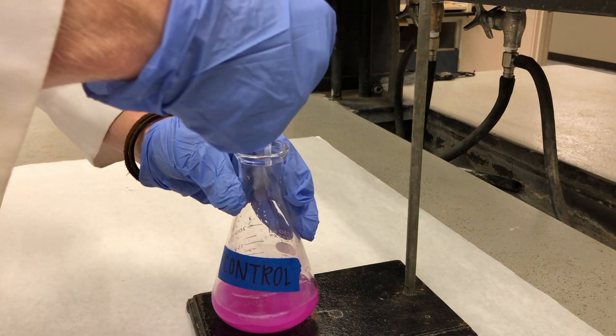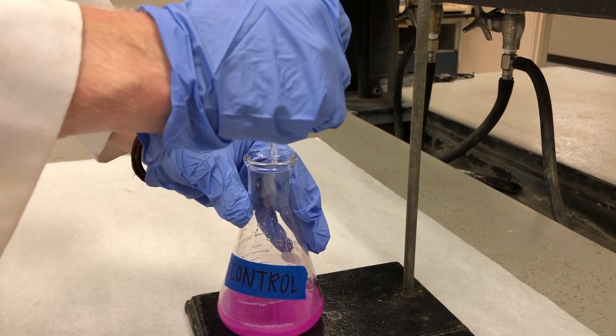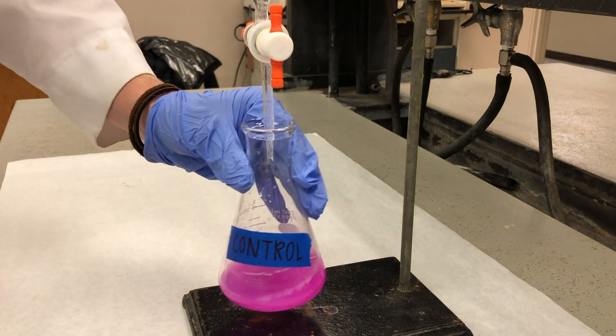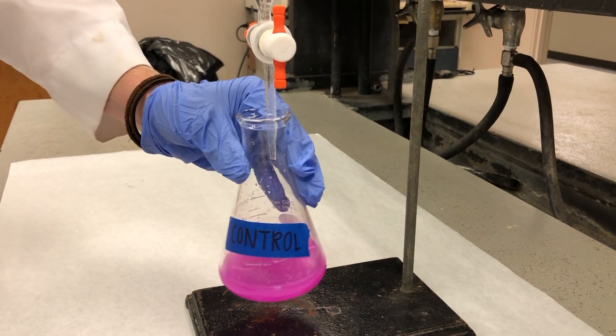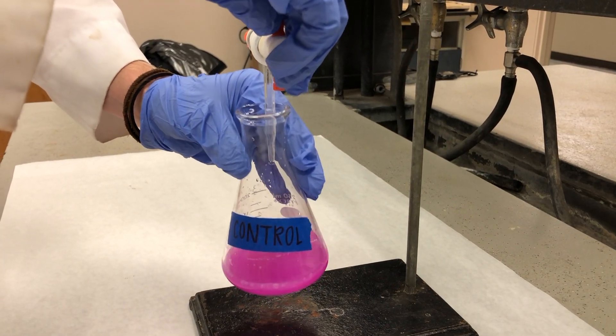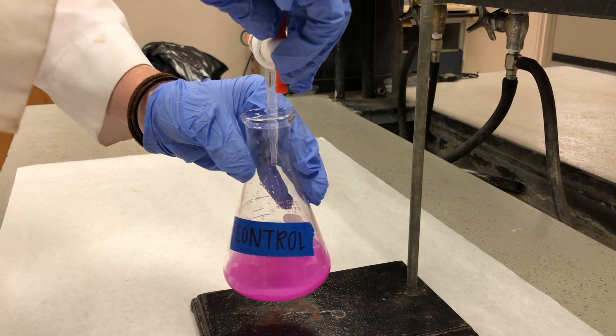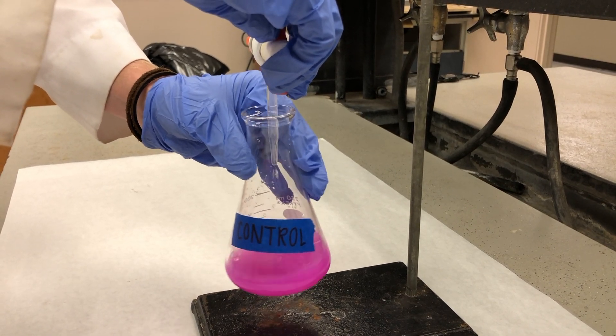Carefully position one of the flasks under the burette opening. Record the initial volume of hydrochloric acid in the burette and allow it to slowly drip into the flask. Swirl the contents of the flask as the hydrochloric acid is added.